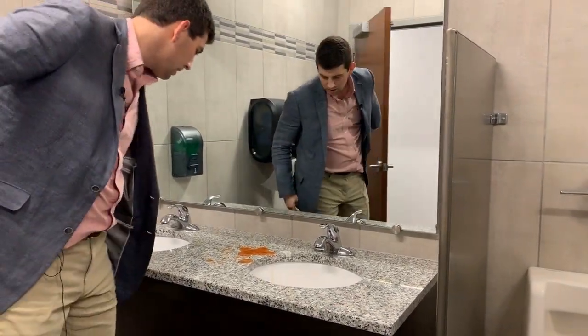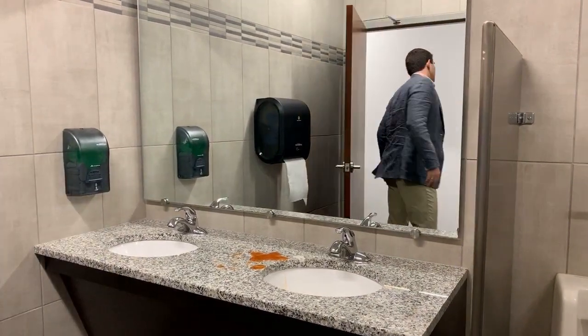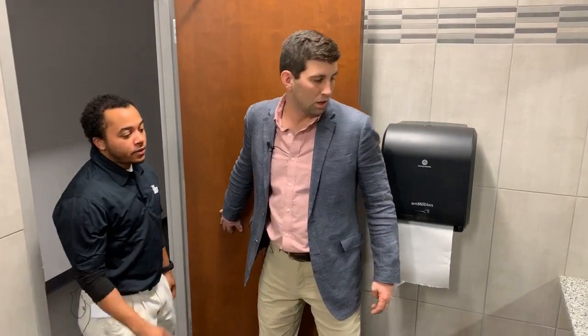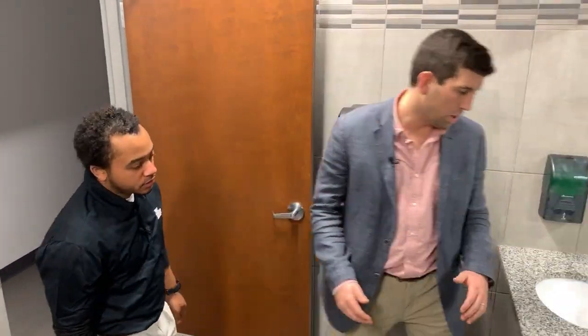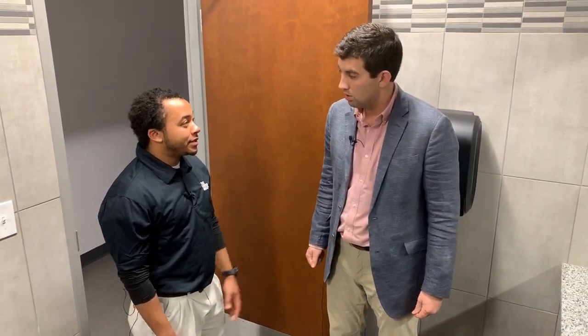What in the world? Is that blood? Hey! Hey, Dennis, can I get your help in here for a second? What happened? Oh, wow. I don't know, man. I came in here to wash my hands, and it looks like someone might have cut themselves, or maybe someone just spilled something. I'm not sure, but I wanted to get your opinion and see what we need to do with it. Well, if it is not blood, we still need to treat it as blood.